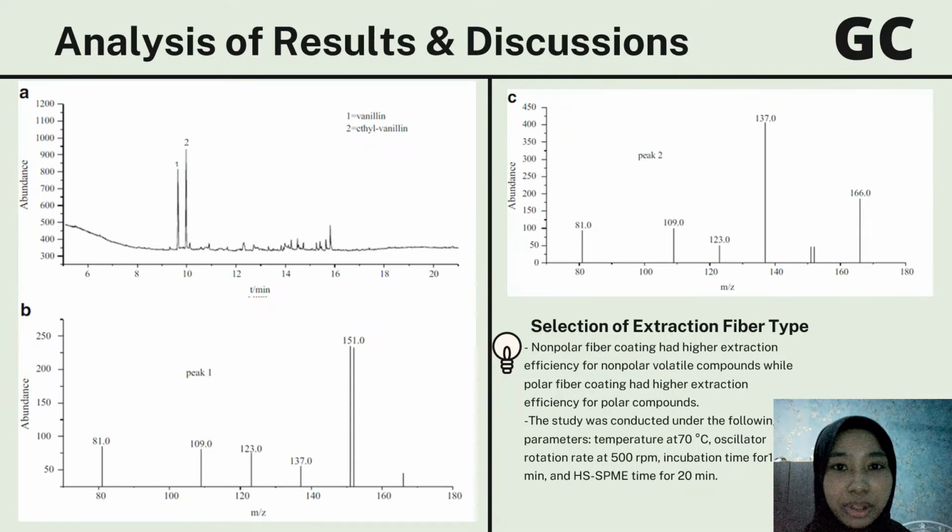In this experiment, we can discuss the result that we found. According to the law of similar mutual solubility, non-polar fiber coating had higher extraction efficiency for non-polar volatile compounds, while polar fiber coating had higher extraction efficiency for polar compounds.